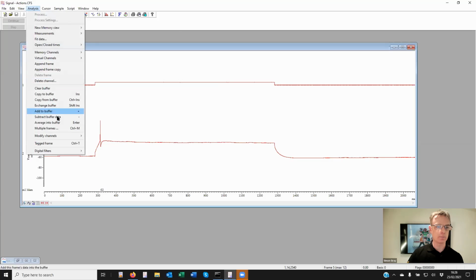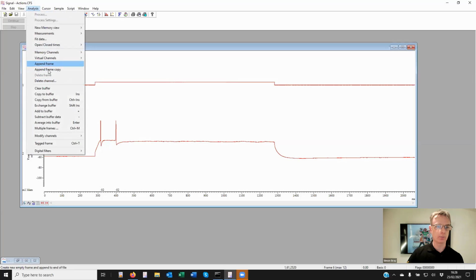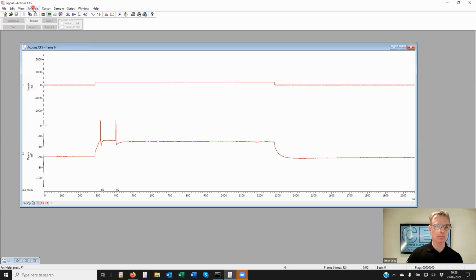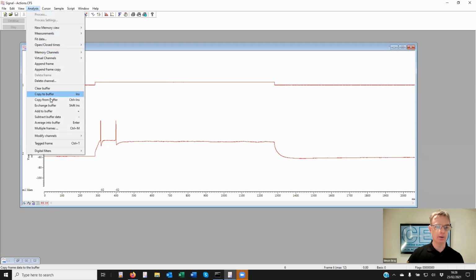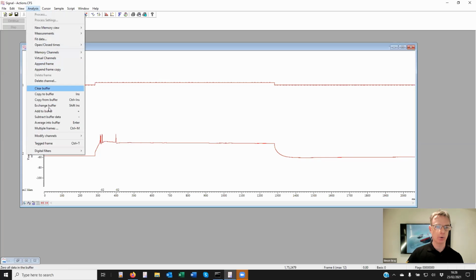Again, and so on. And having done that, you can have an exchange buffer to see the average it's building up. Put that back again.